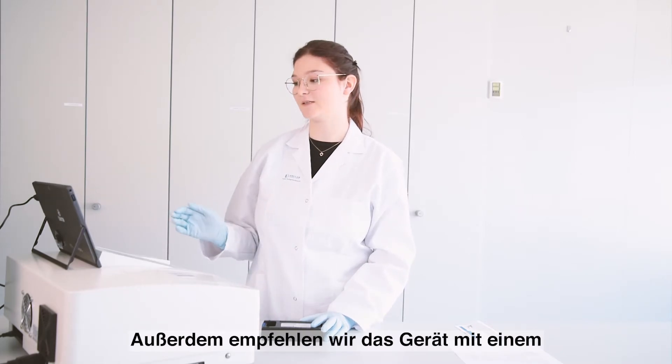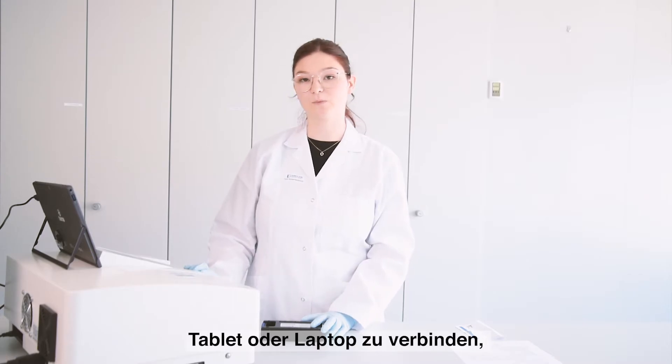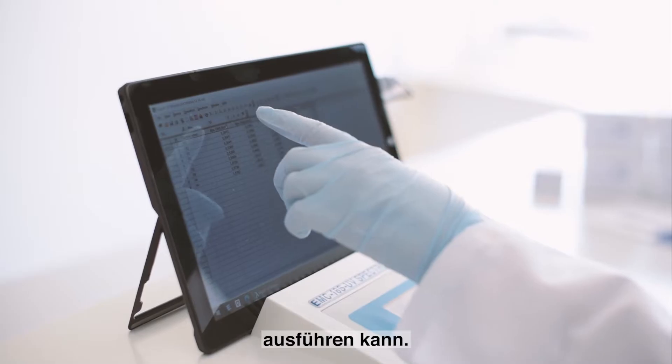We also recommend connecting the instrument to a tablet or a laptop so you can carry out all the scans using the PC software.